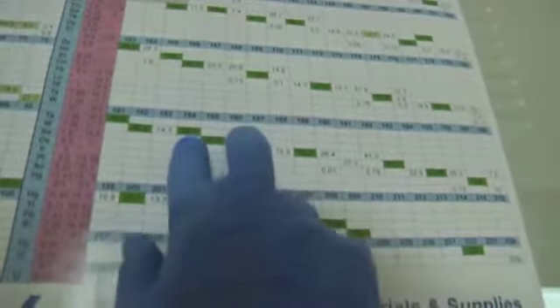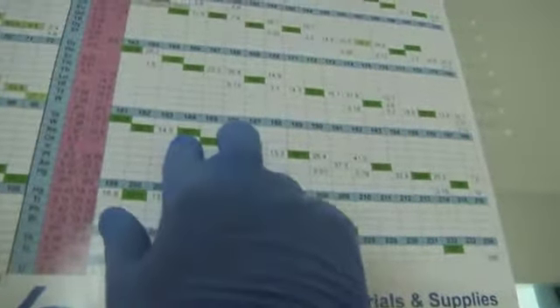But what's really interesting is if you go over to tungsten, which is W, you'll find that tungsten has these percentages in nature, and atomic mass 186, 184, 182 are the real predominant ones. Now these two here, 184 and 186, if you add oxides to those, which is an oxygen atomic mass unit of 16, then they will overlay mercury at 200 and 202, because 184 plus 16 is 200. Yes, we can still do math because we weren't taught Common Core. And 186 plus 16 is 202.